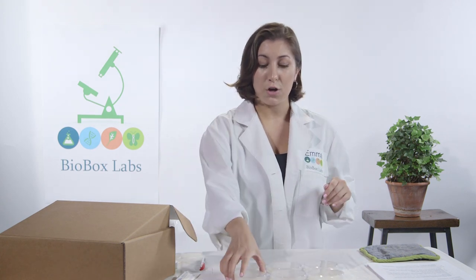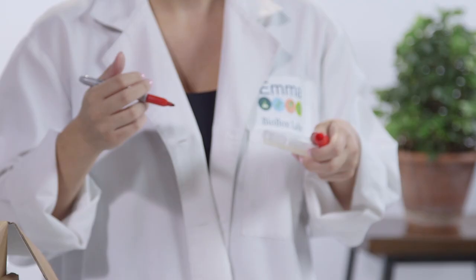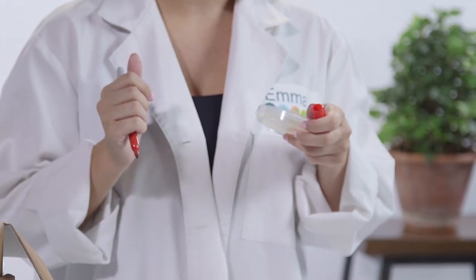Today we're going to start collecting our germs. Start thinking about where you want to collect them — under your fingernails, in the air, your dog's water bowl. I know what I'm going to collect. When you know, write it on the bottom of your petri dish.